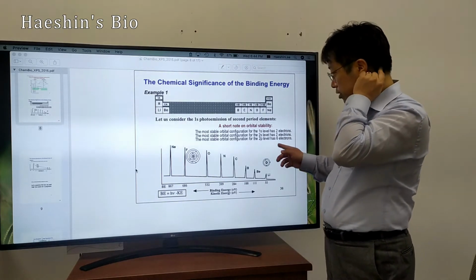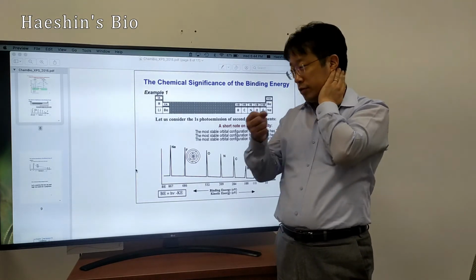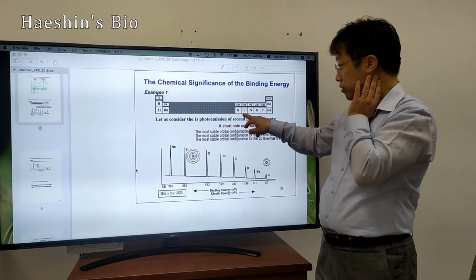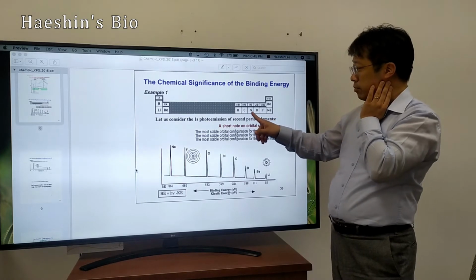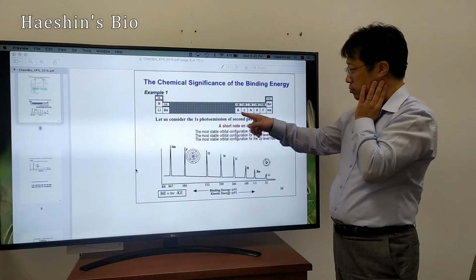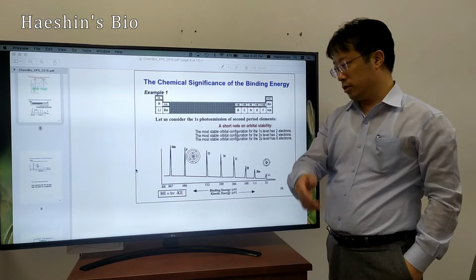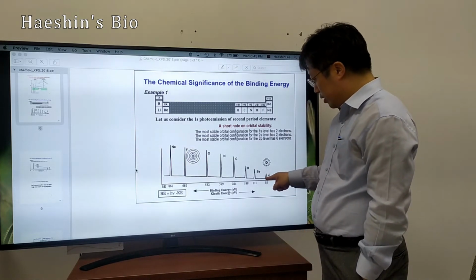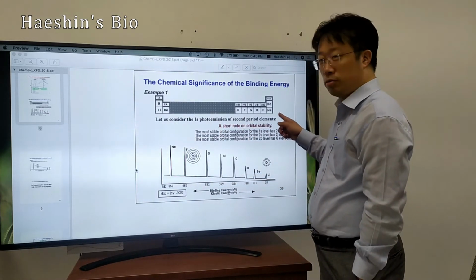So actually, if you take XPS of surfaces from pure lithium metal, carbon such as graphite, graphene, nitrogen, for example nitrogen-doped graphene, or proteins, or boron, whatever you can bring in as surfaces, you see the binding energy getting higher and higher in these directions.